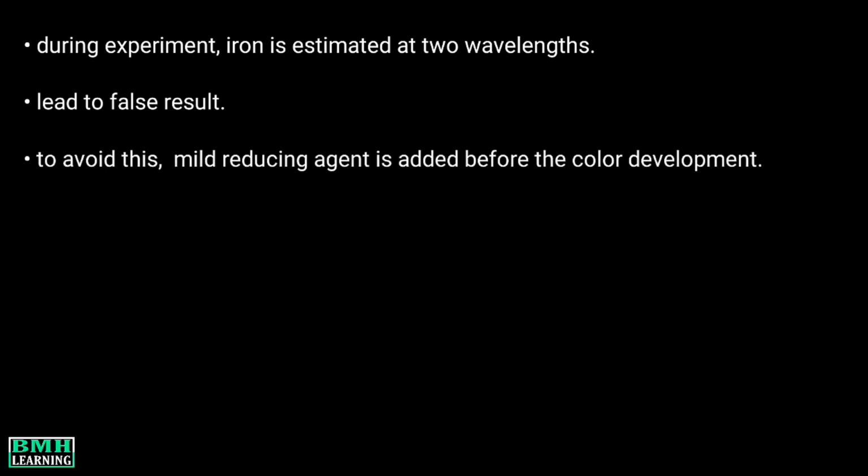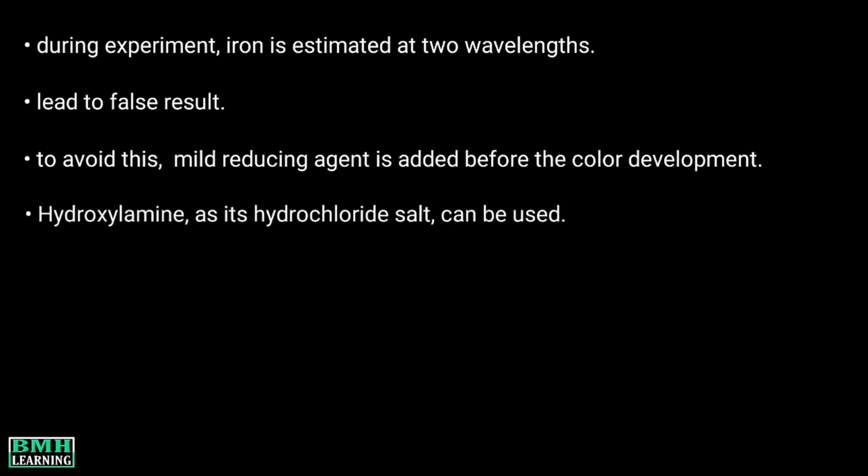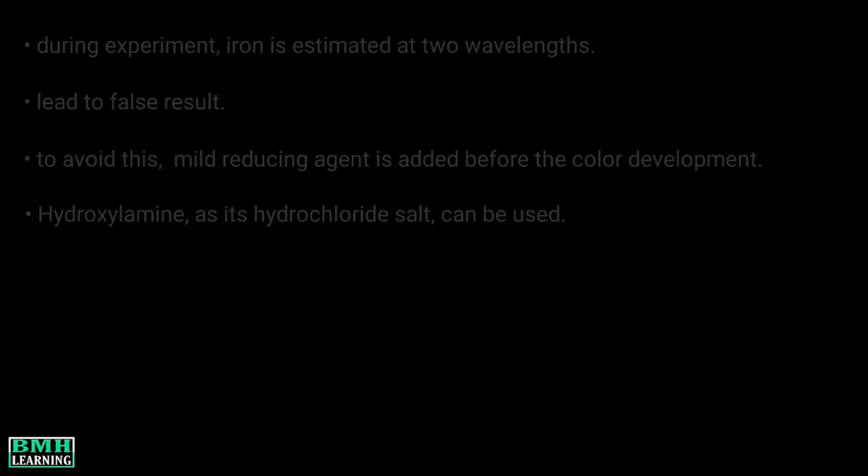In order to avoid this, a mild reducing agent is added before the color development so that we can get a measure of the total iron present in solution. For this, hydroxylamine as its hydrochloride salt can be used.